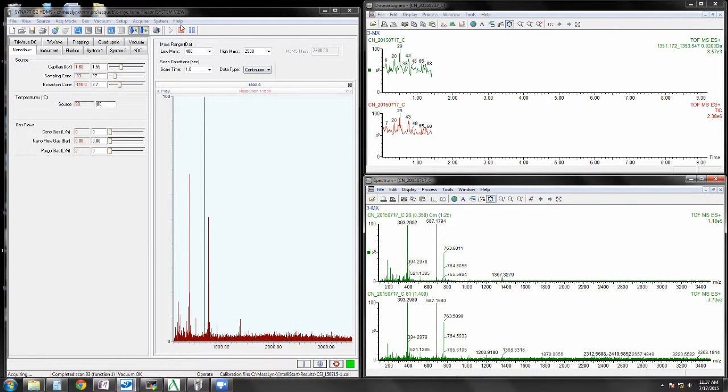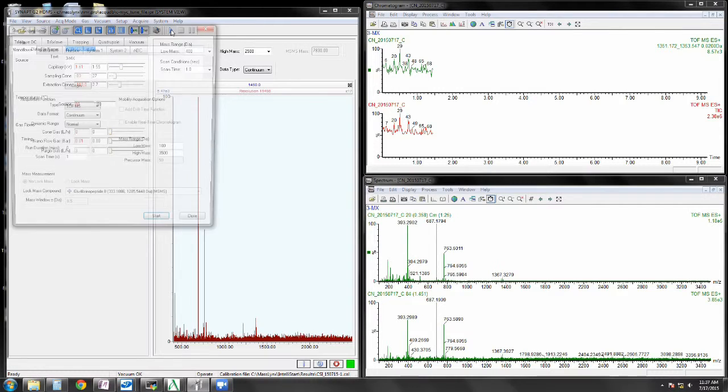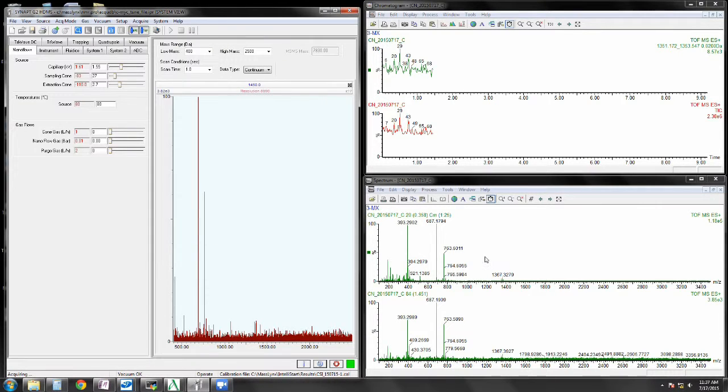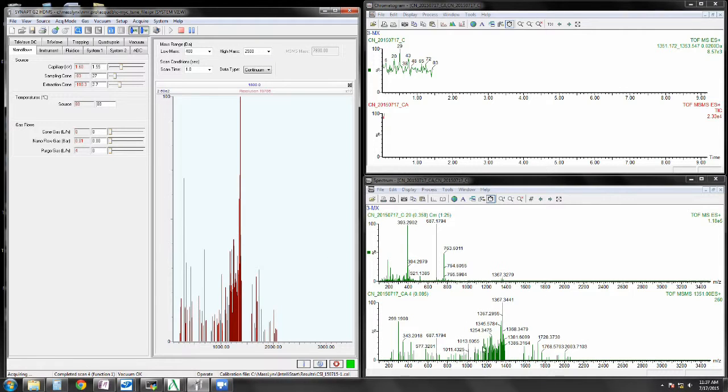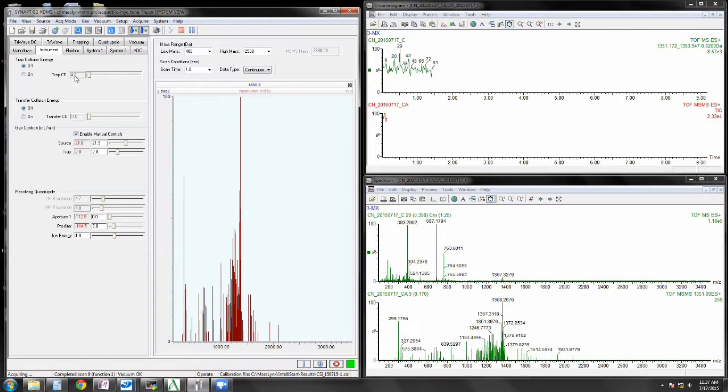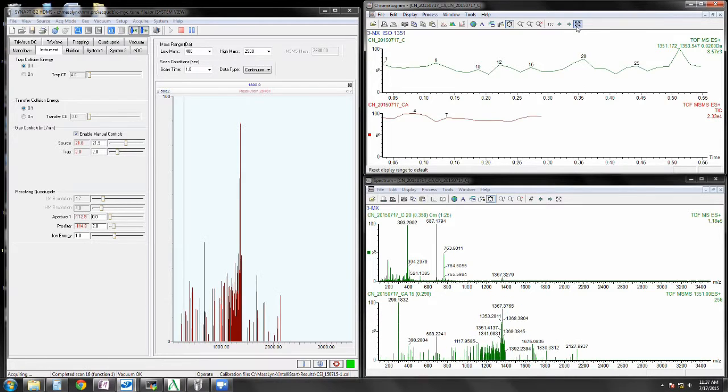When you've acquired some data, you can stop the acquisition. I'll show you how to do a simple isolation and fragmentation experiment. So on this Synapt G2 instrumentation, we're going to do TOF MS/MS. And we're going to isolate the octamer peak. And we're going to label the spectra as isolation 1351 peak. Now we'll see in the spectrum just simply this peak has come through. And there's some fragmentation down to the lower species already as this species is quite fragile. If we let this acquire for a number of seconds, say at the 30 to 40 second mark, I can then start increasing the energy in the trap cell.